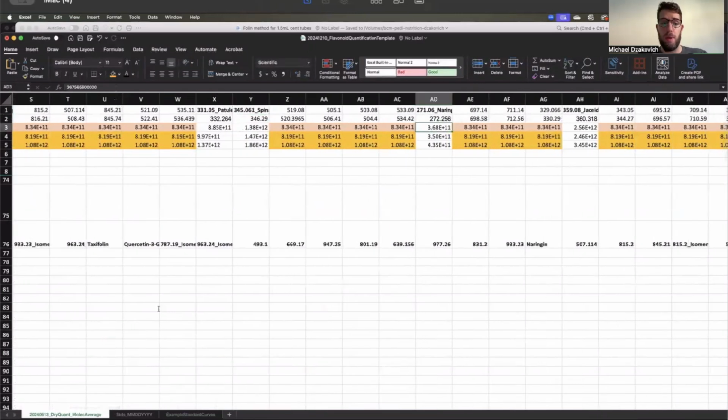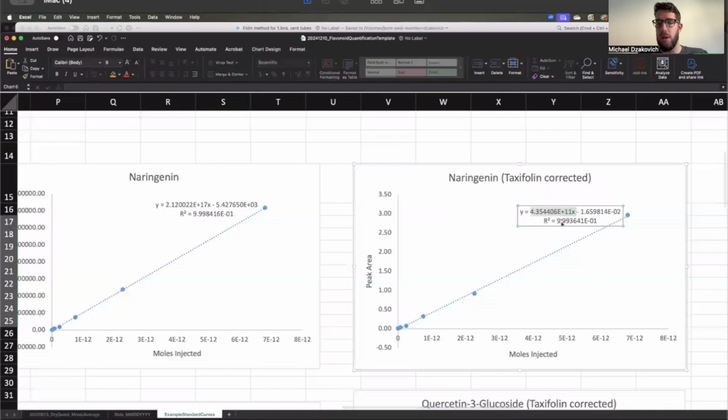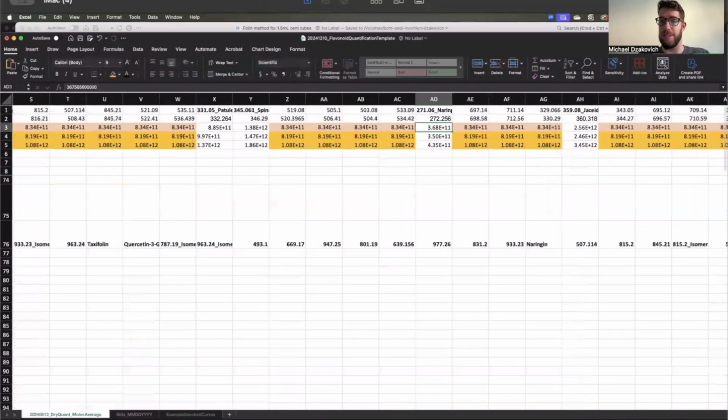But remember that when you copied it, that was grabbing an X as well. That X makes it not a number anymore when you paste it into a cell in Excel, so you'll have to delete that. You can see up here where I'm moving my cursor, that's the actual slope that you would want to put in there, and delete that X. Okay, so that's the main thing.